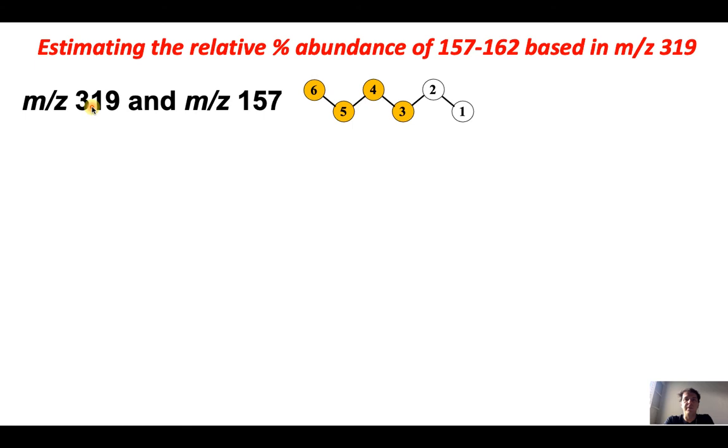Both electron impact and also APCI show this. And the region of the chromatogram is very nice, so it's a very good fragment. And here we are assuming that if they have the same carbons of the compound, they would have the same relative abundance of M0, M1, M2, M3, M4, and so on.